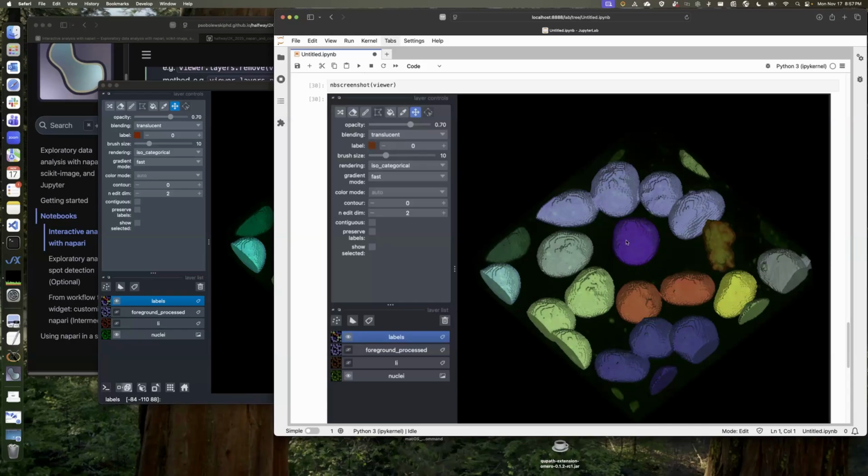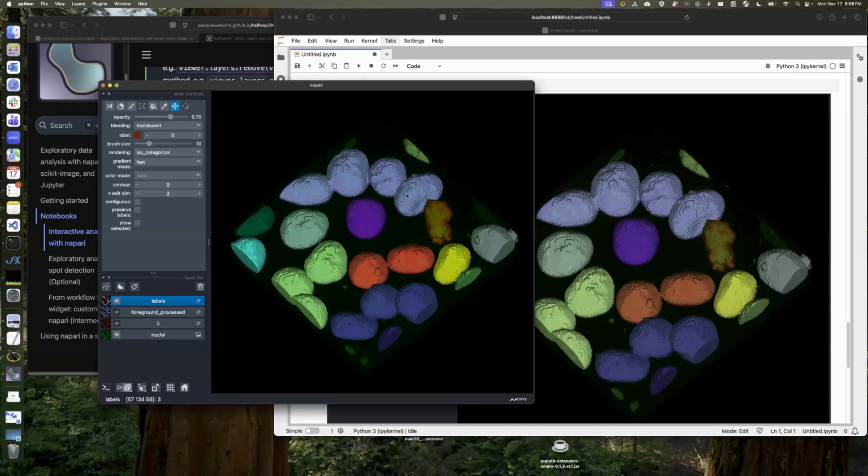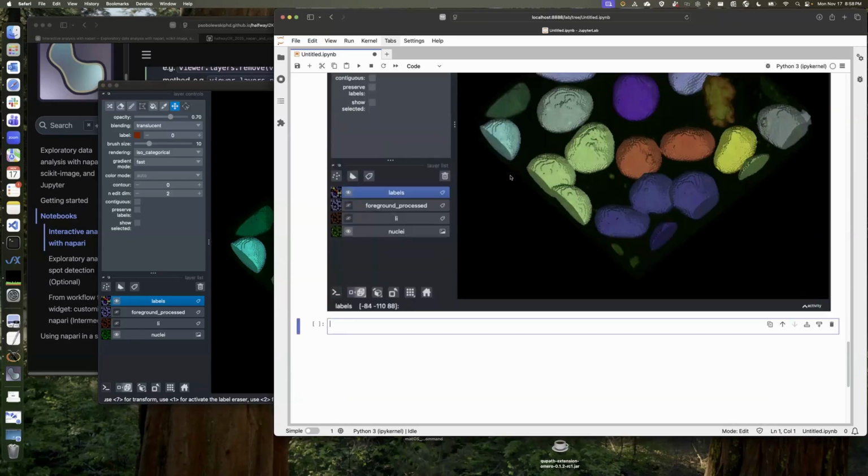One way we could do that is something called a distance transform. What a distance transform does is it attempts to find, for each pixel, the distance to an edge. When you do a distance transform, you will tend to reduce objects to something that resembles a skeleton a little bit. Where the intensity will be the highest, that's the point that's furthest away from the edge. So we could use that distance transform as the starting point for where to automatically put a marker. And that's what we're going to do.